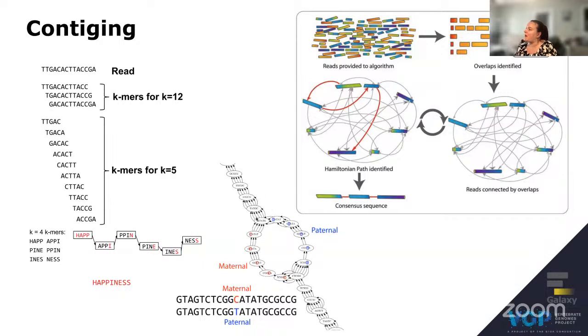And so you have this ideal graph, when you have one sequence and a bubble when you have heterozygosity. In practice, it's a bit more complex because you have repeats, you have errors of sequencing, but essentially what we want to look at is this kind of graph. And so this kind of bubble represents the diploid genome.